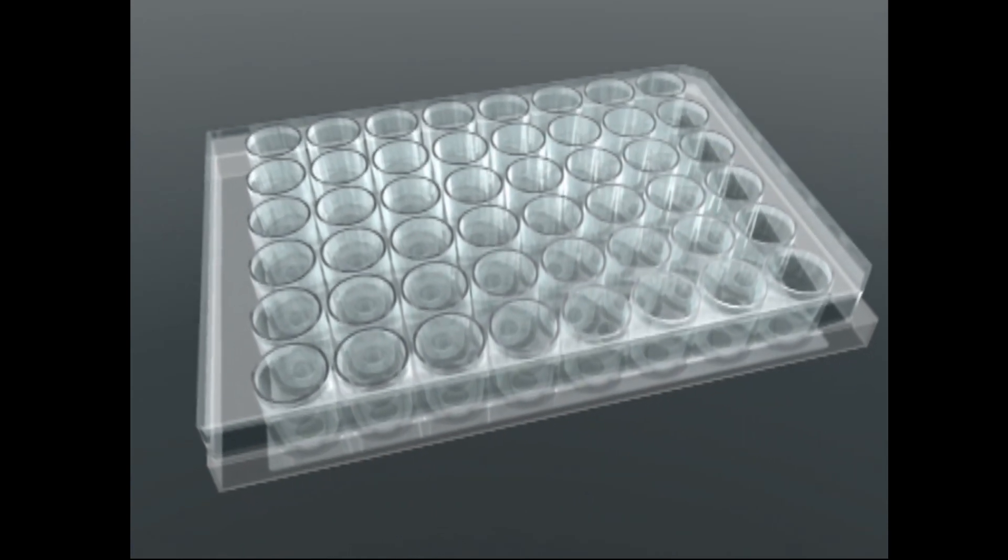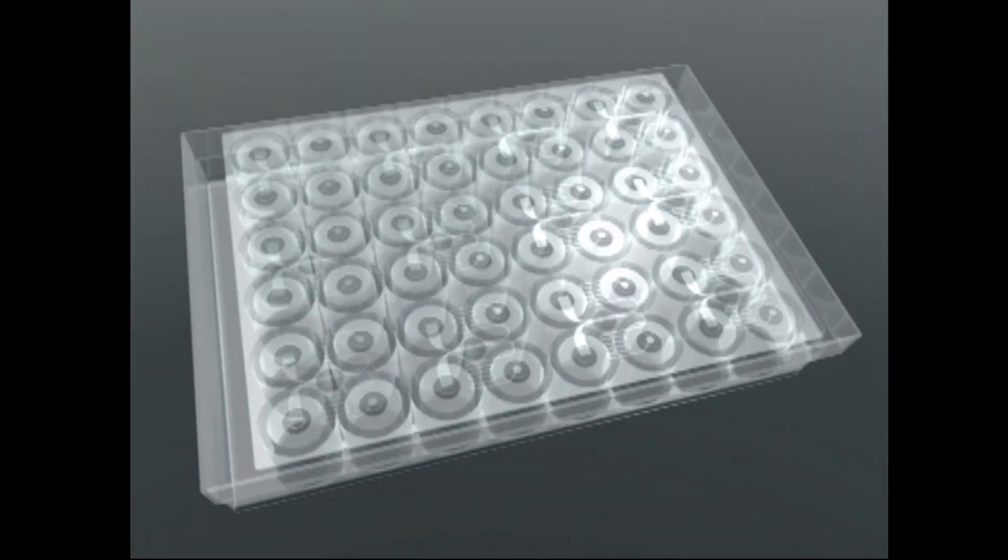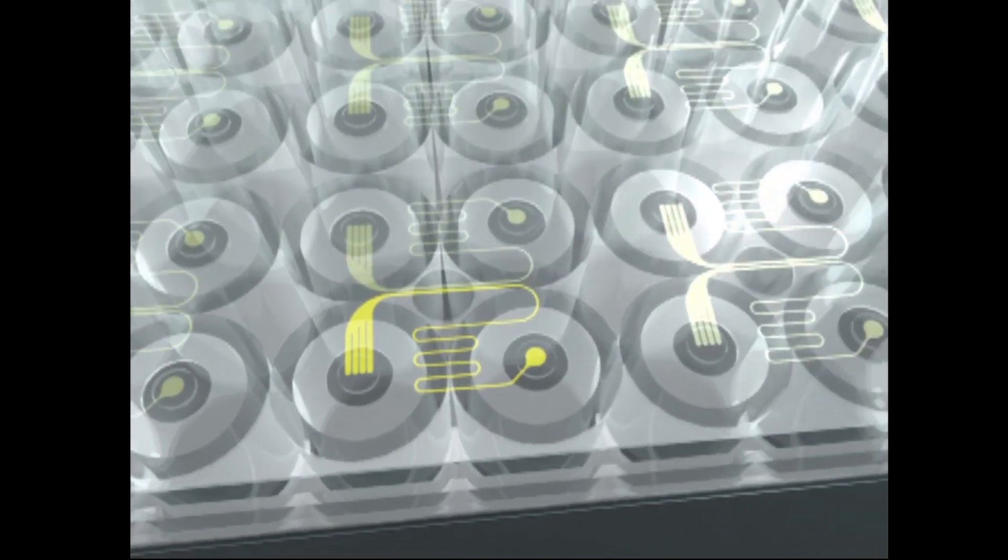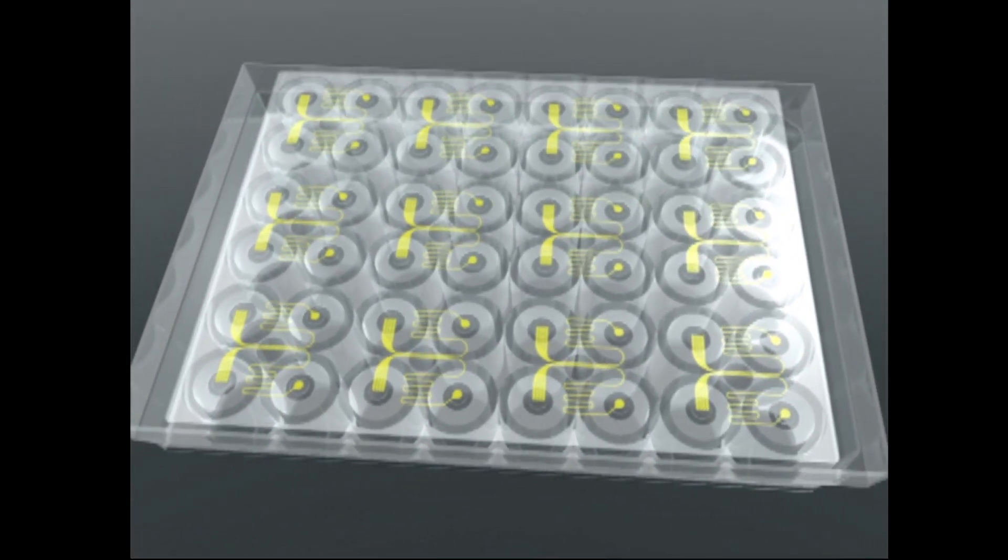Each plate contains an array of micron scale flow channels which run along the bottom of the plate. The wells of the plate serve as reservoirs for the reagents going into and out of the flow channels. Here we are showing the 48 well high shear plate. This plate contains 24 experimental flow channels each connecting to an input well and an output well.